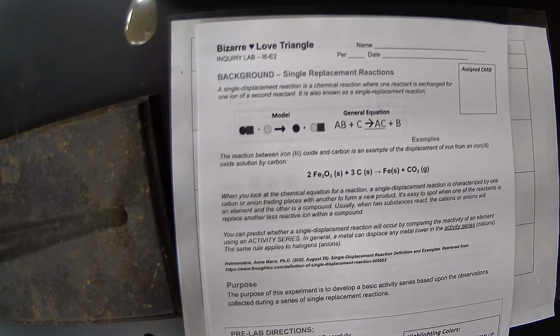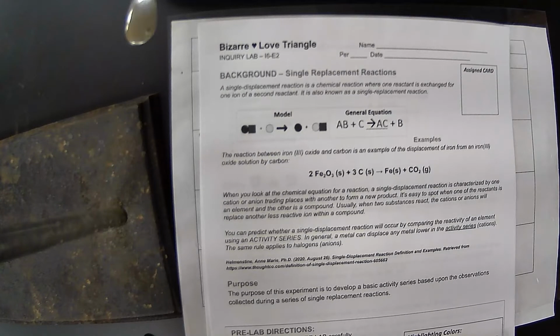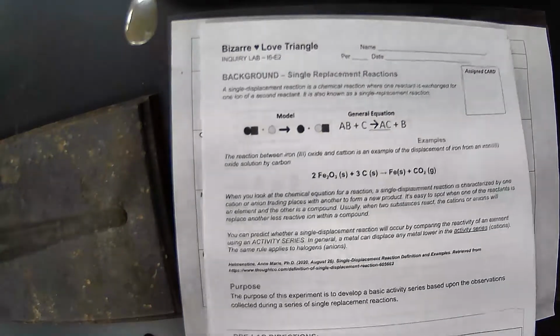You can predict whether a single replacement reaction will occur by comparing the reactivity of an element using an activity series. In general, a metal can replace any metal lower in the activity series. The same rule would apply for halogens or anions. So the purpose of this experiment is to develop a basic activity series based upon the observations collected during a series of single replacement reactions. After we've read through the entire lab and highlighted the background and the procedure to identify all of our actions for today, we're going to go ahead and get started.